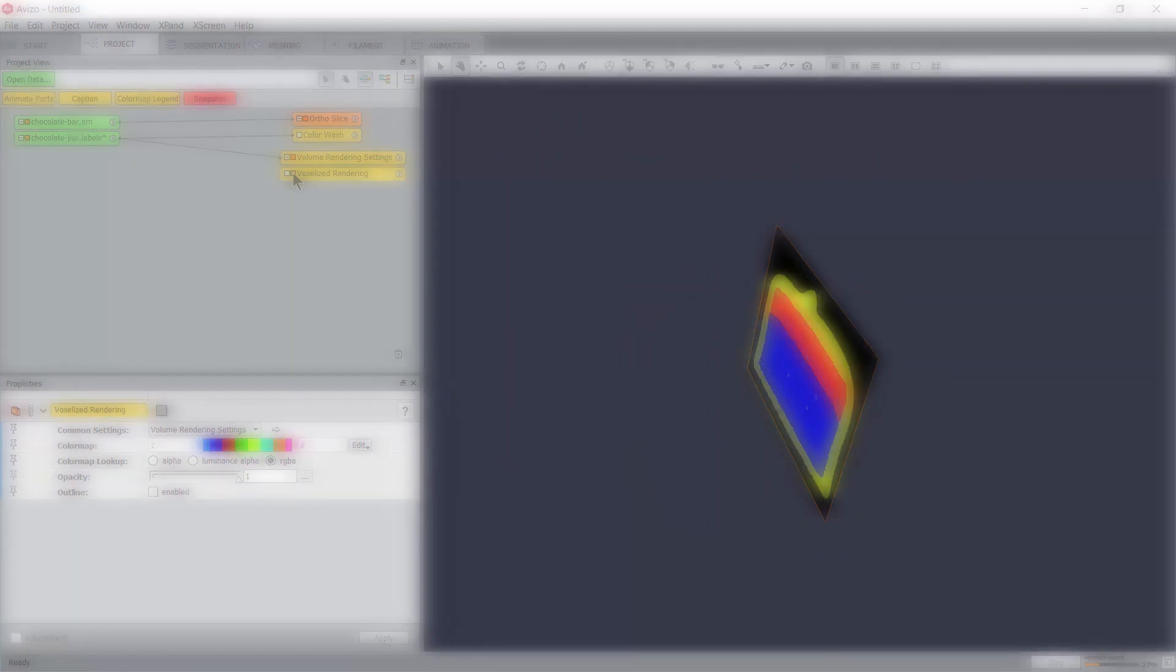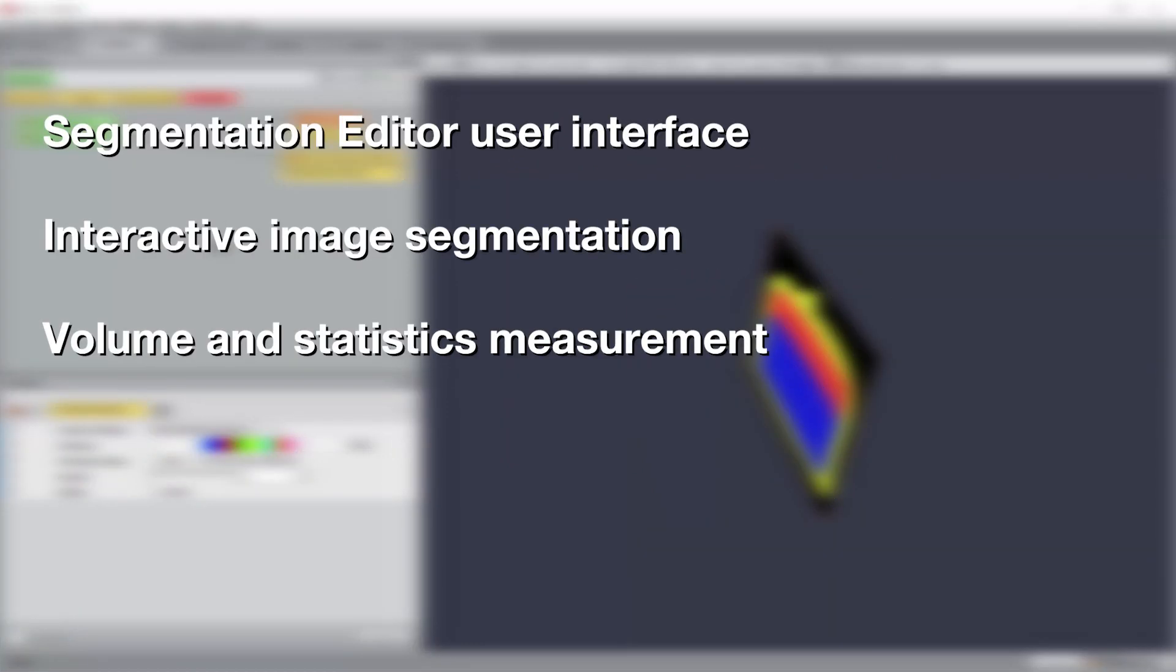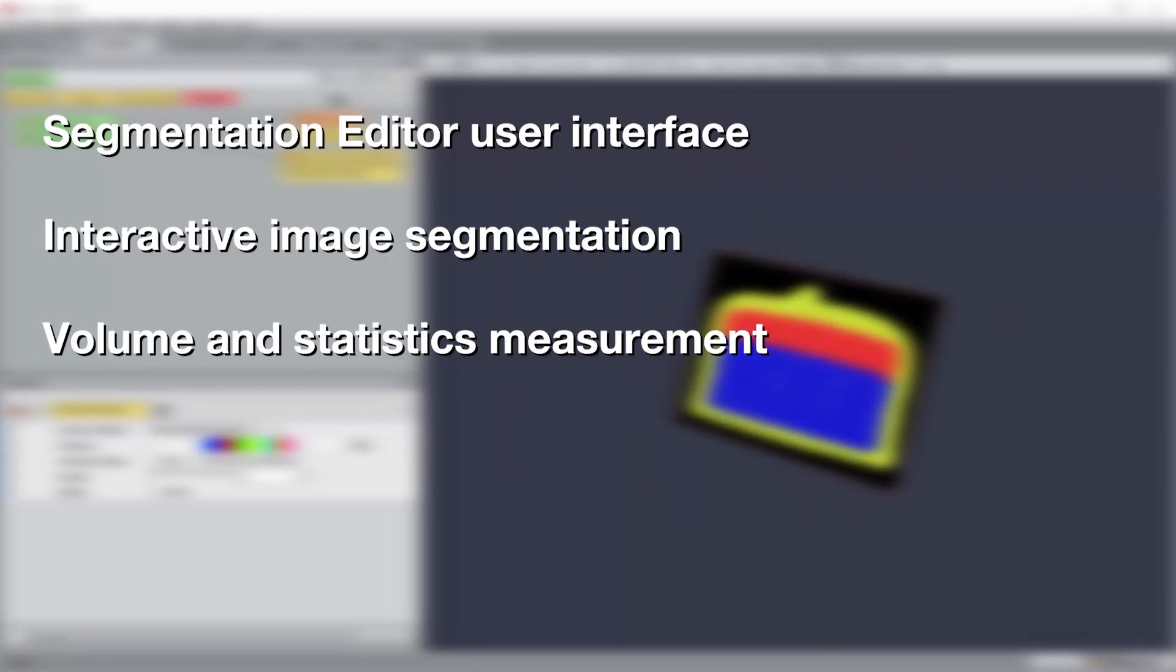The present tutorial introduced you to the main principles and tools of the segmentation editor, and how to use them to perform interactive image segmentation. Thank you for following it, and goodbye.